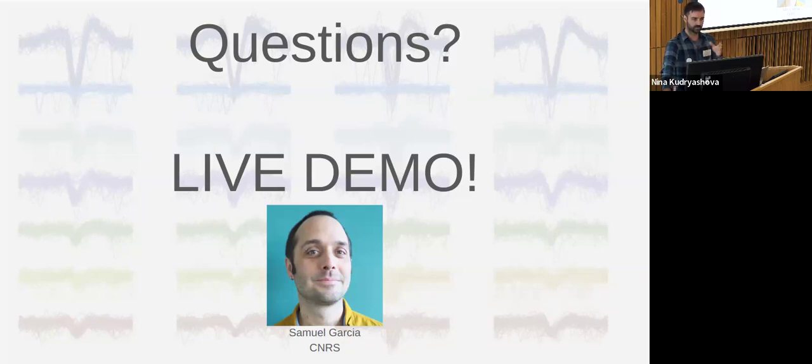But for Kilosort up to Kilosort 3, if you don't have binary data to start with, the first step of the spike sorting is to convert and save a binary .dat file that Kilosort can read. So it's a temporary duplication of the data, and this file can optionally be removed. I say optionally because if you then use Phy, Phy can read this file, so you can check the spike-sorted spikes.